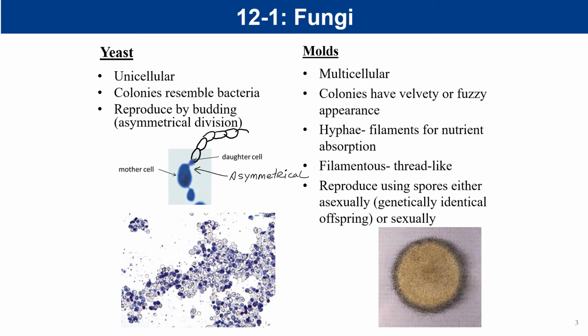Hyphae are long thread-like filamentous structures. And occasionally, especially in rapidly growing yeasts, a type of growth called pseudohyphae can be observed. Pseudo meaning false, and then hyphae would normally be something that you would find as a growth structure on molds rather than yeasts.